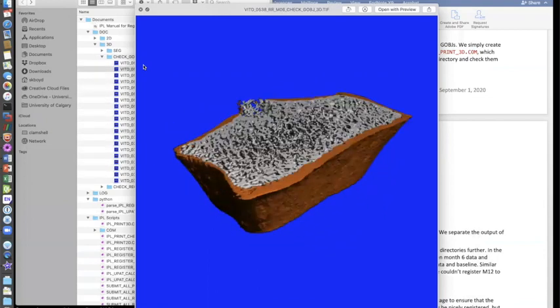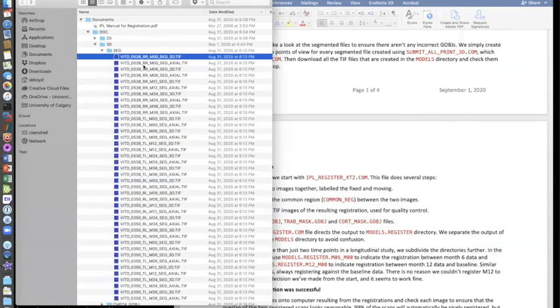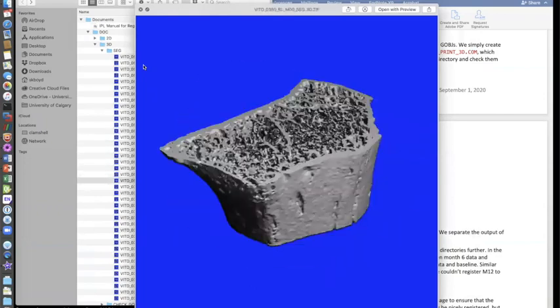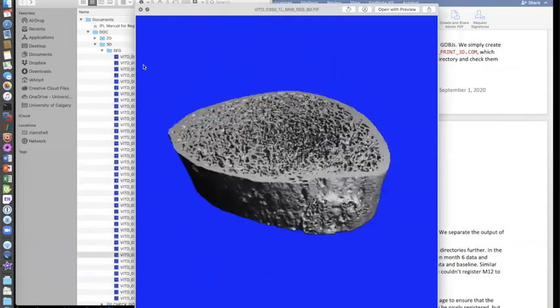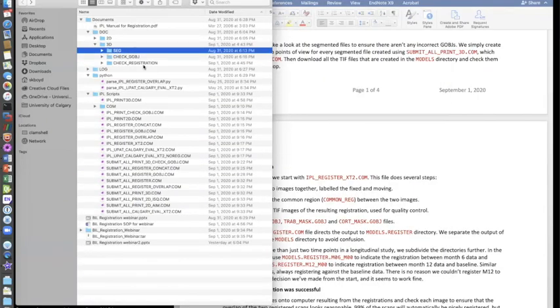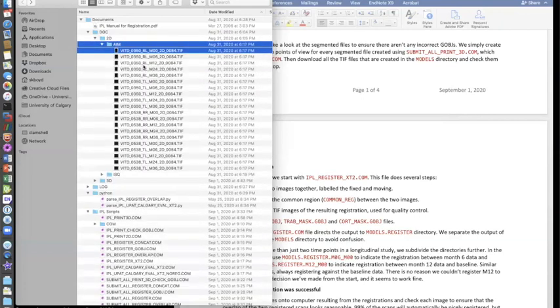So creating all these images is a really good way for large data sets to make sure everything's okay. Was the segmentation okay? Did we accidentally missegment things? So I'm going through different time points and 2 views for each time point, and I see the different kinds of bones here to get an idea of the segmentation. So that's what is shown in the doc directory.